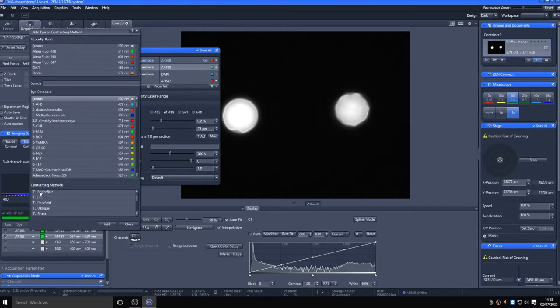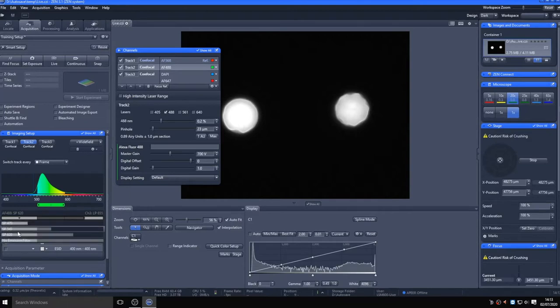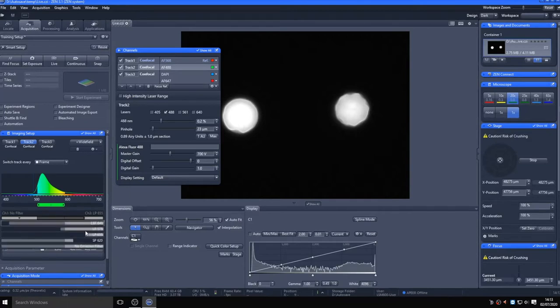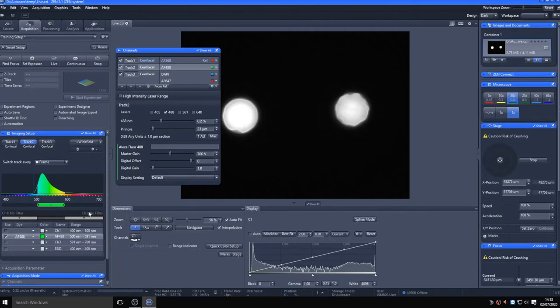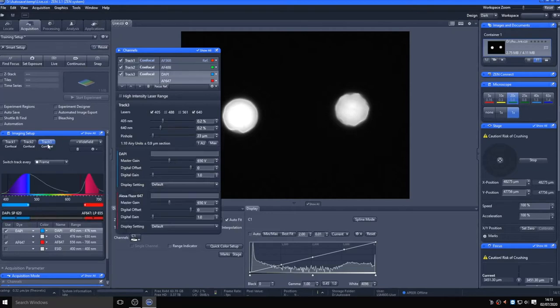Although smart setup does a good job of configuring the microscope, there are some occasions where it makes some choices which may not be optimal for your sample. Looking at the way the smart setup has separated the channels, with DAPI and Alexa 647 using the two outer detectors makes perfect sense, as neither fluorophore is likely to bleed through into the other channel despite both lasers being utilized at the same time. Track one looks fine, with the sliding dichroic limiting the detecting range around that particular fluorophore quite well.